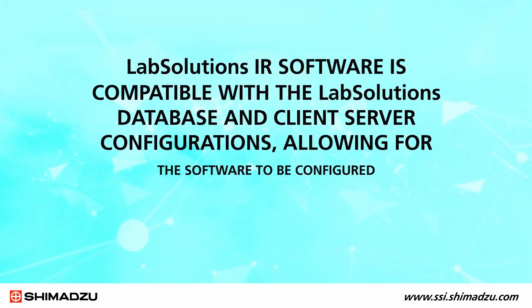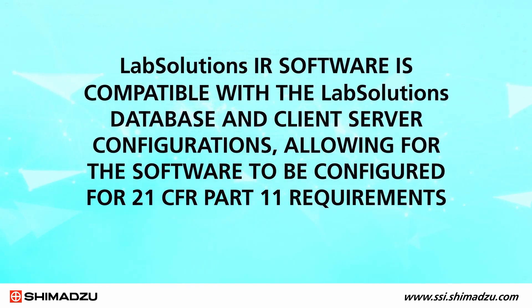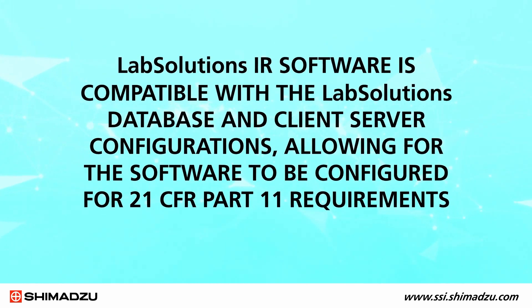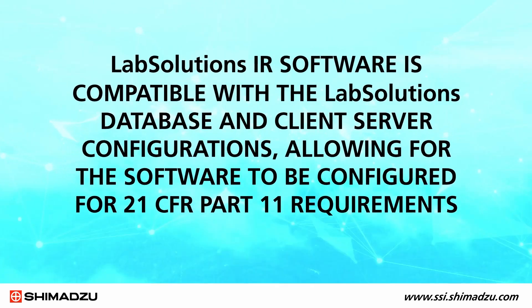The LabSolutions IR software is compatible with the LabSolutions database and client server configurations, allowing the software to be configured for 21 CFR Part 11 requirements.